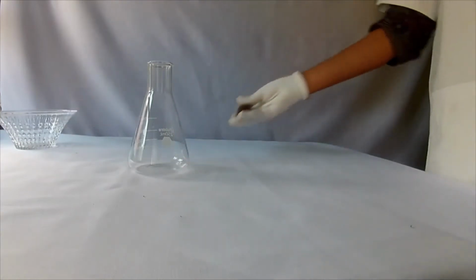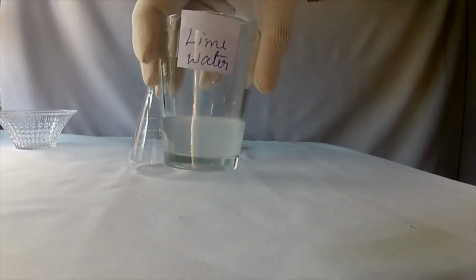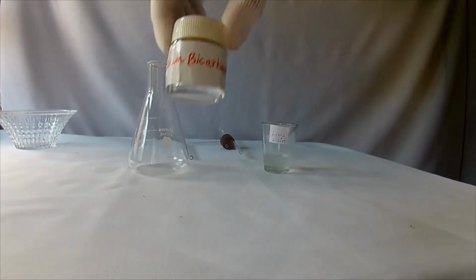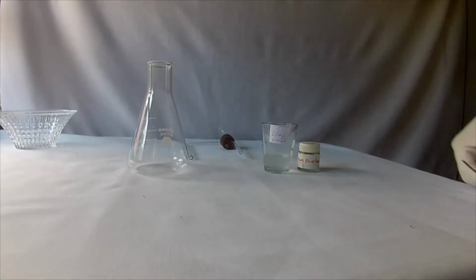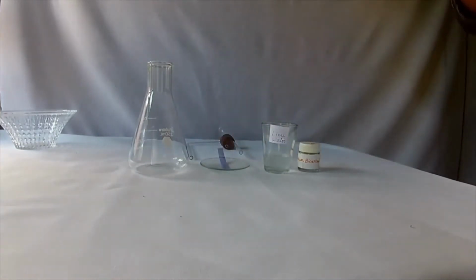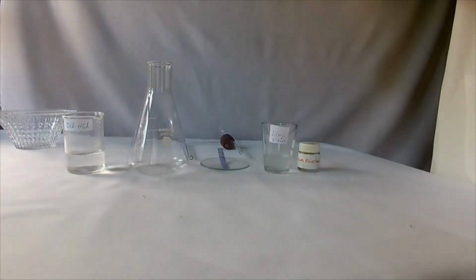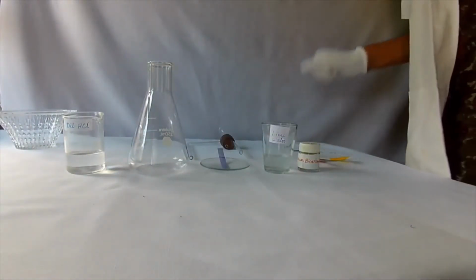Take a conical flask, delivery tube and thistle funnel fit into the cork, lime water, sodium bicarbonate, blue litmus paper, dilute hydrochloric acid, potassium permanganate and potassium dichromate paper.